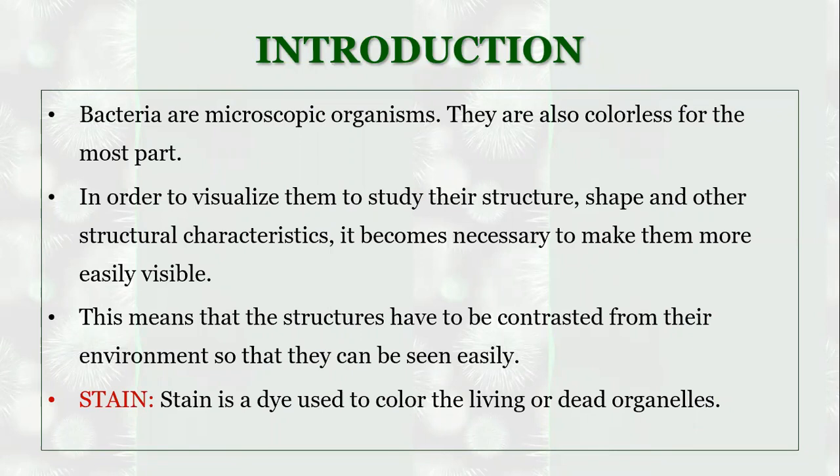The bacteria are microscopic organisms and they are colorless. So, these bacteria cannot be visualized properly under the microscope. In order to enhance the visibility of microorganisms and to study the structural features and shape of the organisms, these staining techniques were developed. The addition of these stains makes the organism more visible. This means that the structures have to be contrasted from their environment so that they can be seen easily.